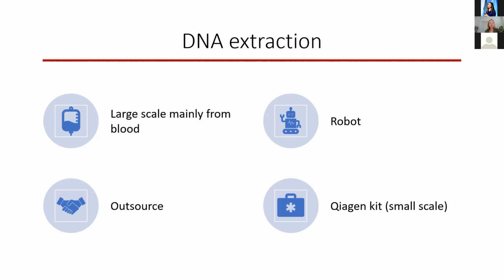You can also outsource the extraction to specific companies who specialize in these activities. It is, of course, also possible to extract the DNA manually. We are using a QIAGEN kit, but there are many other different kits for extraction of DNA. It's recommended when you do small-scale studies because for thousands of samples, manual extraction is very tedious.